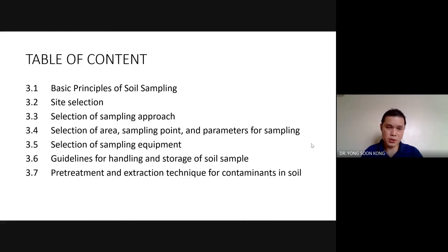Now, the storage and handling depends on what you are going to analyze. So again, just like what you have been discussing in air sampling and emission sampling, you're either going to analyze organic or inorganic compounds. These most likely happen to be your pollutants also, and these are things you also need to consider.